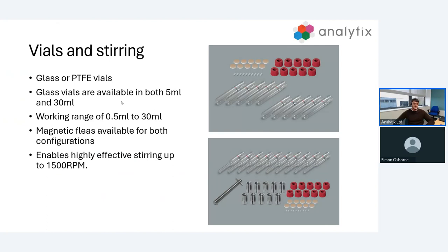To match the individual needs of each lab, we have a range of available vials. We have two materials, glass or PTFE vials. The PTFE vials are 30 mil and the glass vials are available in both 5 and 30 mil. You can see our 30 mil vials at the top there and our 5 mil vials beneath.